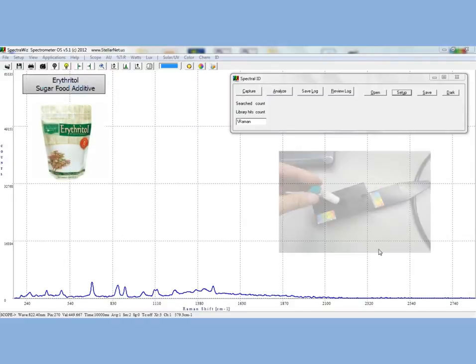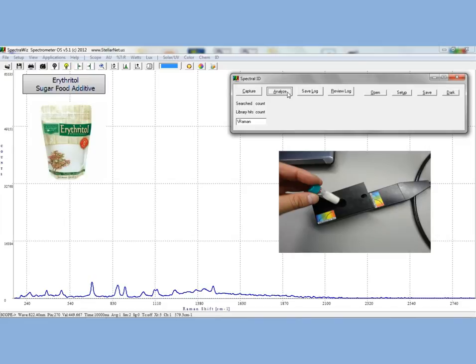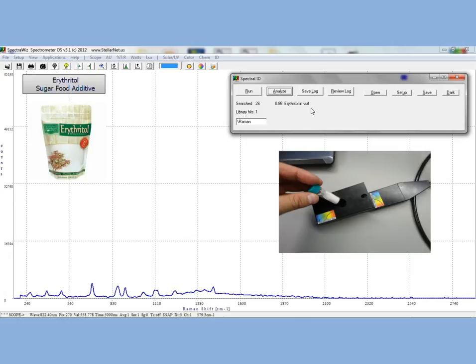In this first example, we will be measuring erythritol, the sugar alcohol and white crystalline powder that has been approved for use as a food additive in the United States and throughout much of the world. It is 60-70% as sweet as table sugar, yet almost non-caloric. Here I have put some in a vial and we will measure its Raman Spectrum.